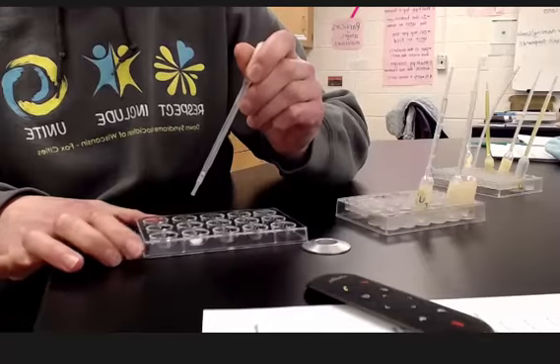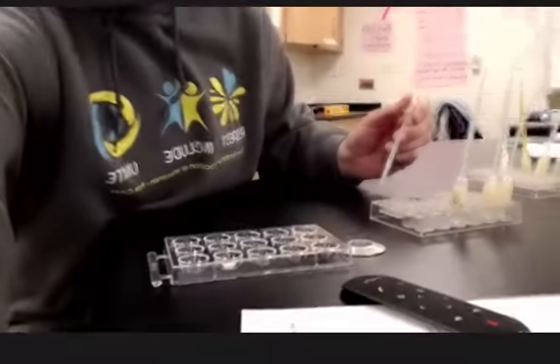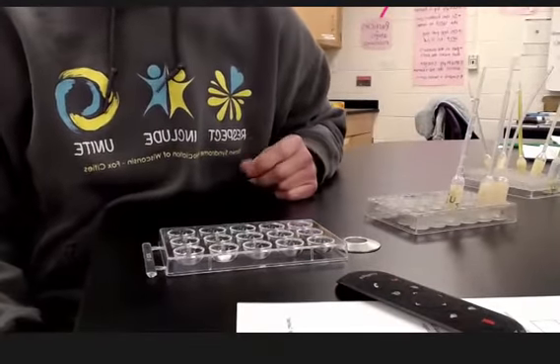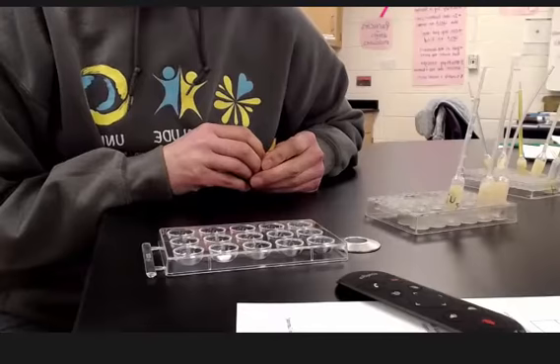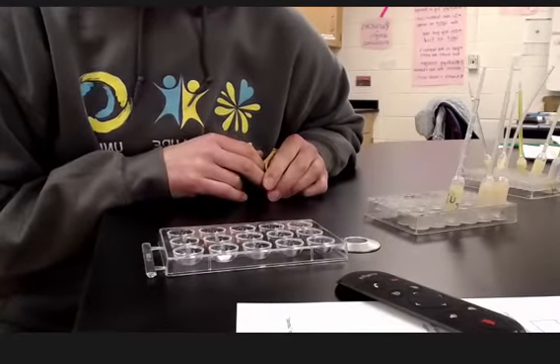This one you can see turns white. Can't see from there. Okay, turns white and cloudy. So that indicates that a precipitate formed. And that was for our combination with A and 1. A is silver and 1 is chloride. So what we did was we formed silver chloride. And that's the example I did for you in the analysis section.